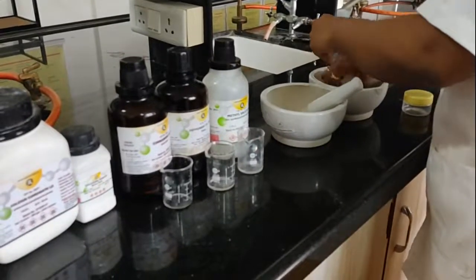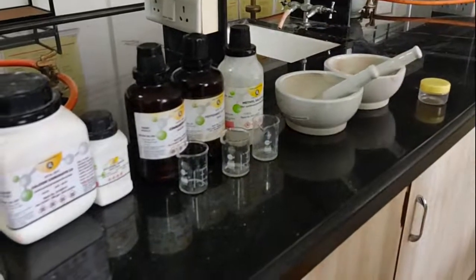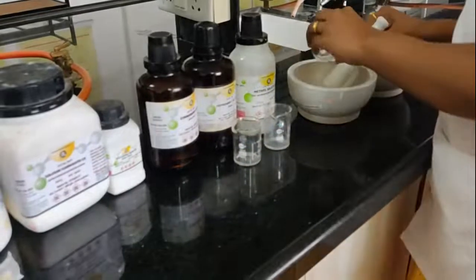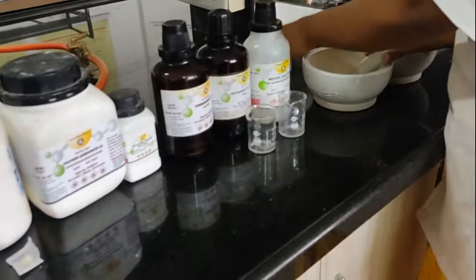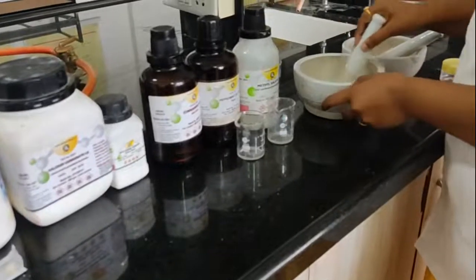Then after that, the next addition of the volatile oils: the cinnamon oil is added into this first mortar, and also simultaneously it is added into this second mortar. Now I will proceed to trituration of it.